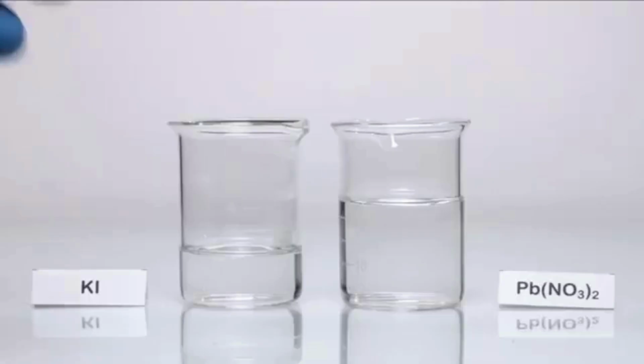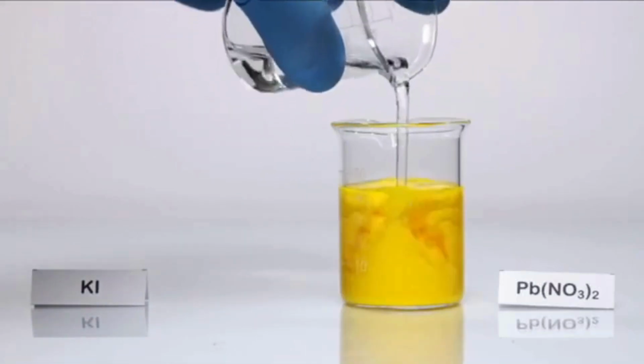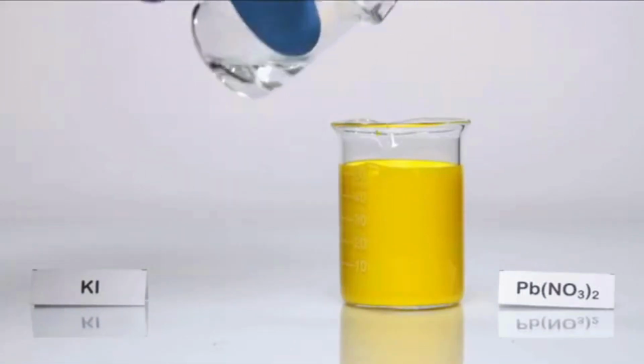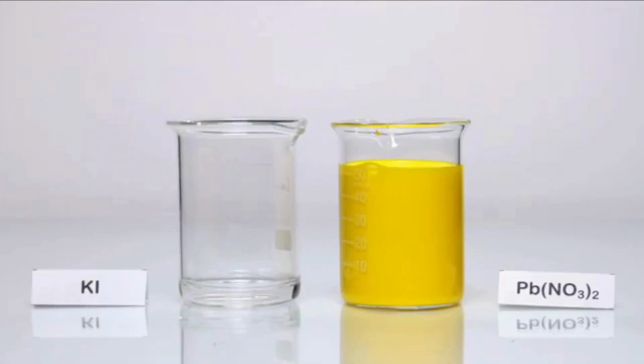Here's another example. Again, two colorless solutions. We pour one into another and boom, we again get a beautiful yellow color solution. What's going on over here? To find out, let's dig a little deeper.